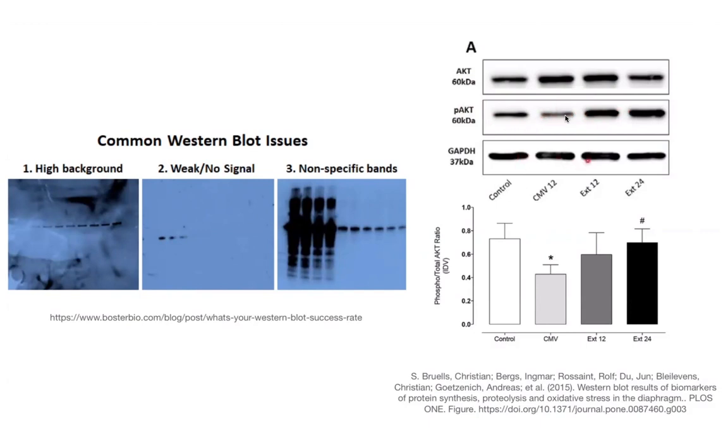And by comparing them directly to the levels of GAPDH, which we can see are very consistent between them, you're actually able to somewhat quantify the levels. And so you will see often people will do these Western blots and then normalize to their control, to the GAPDH or whatever housekeeping gene, in order to then show you how we can compare the actual amounts.